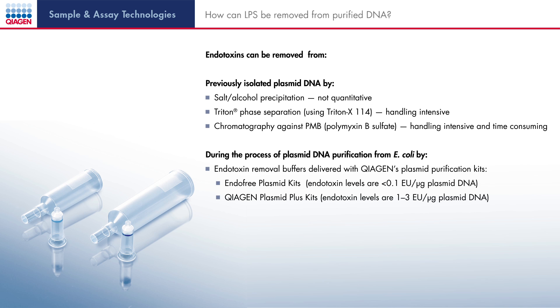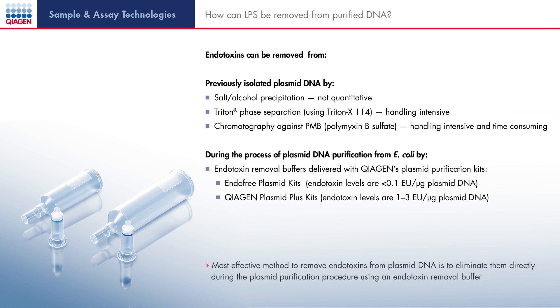From what we have learnt, endotoxins have to be removed from plasmid DNA to guarantee optimal results. There are two ways to do this: removal of endotoxins after DNA purification, and removal during DNA purification. If the DNA is already prepared, there are three very common methods used to remove endotoxins. Salt-alcohol precipitation of DNA from solution removes salt, guanidine, and endotoxins. This is not a quantitative method but may be sufficient to improve transfection, especially for cells that are not extremely sensitive to endotoxins.